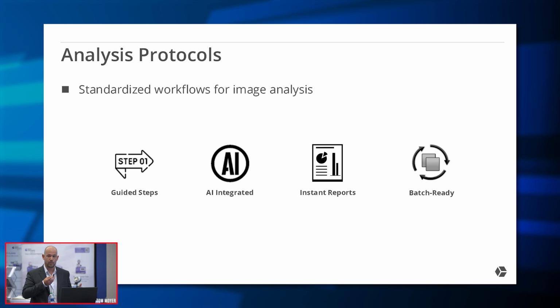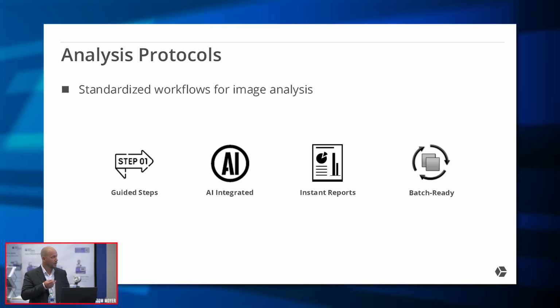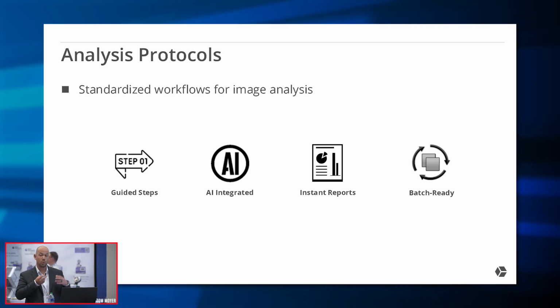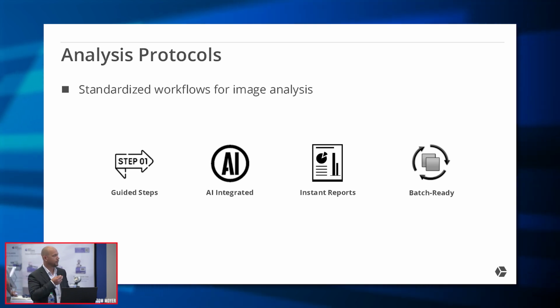Once you have gone through an initial protocol and you have set up the parameters, you can now save your own customized protocol. You can take it out of what we call interactive mode, the guided workflow, and now we can perform either a one-click operation to go through all of the steps, or you can batch process a folder filled with images, all with the click of one button.